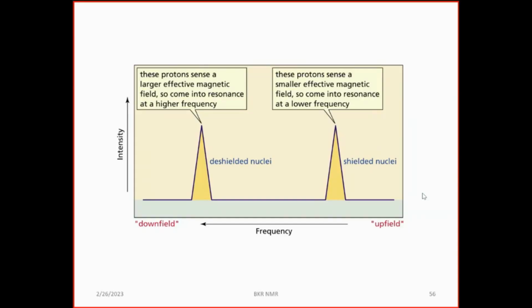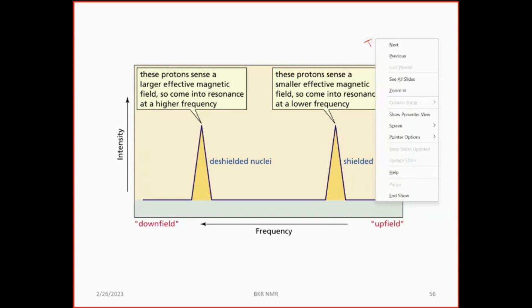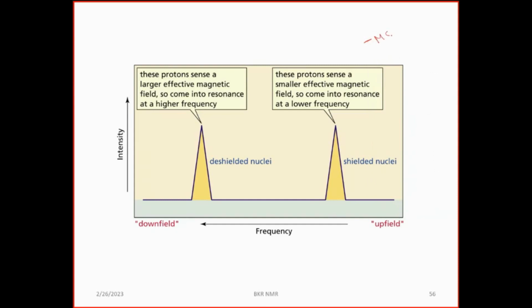So last class we were looking into shielded and de-shielded nuclei. So we were talking about TMS. What is TMS?